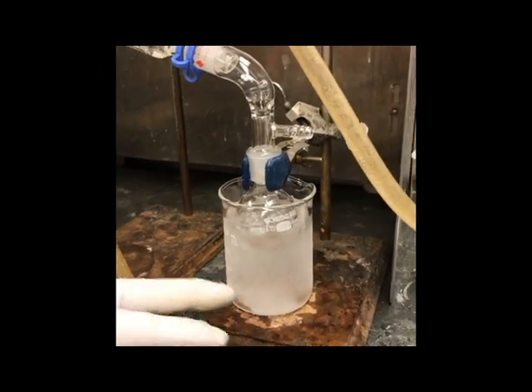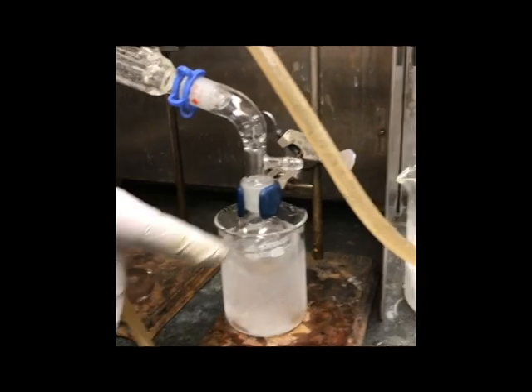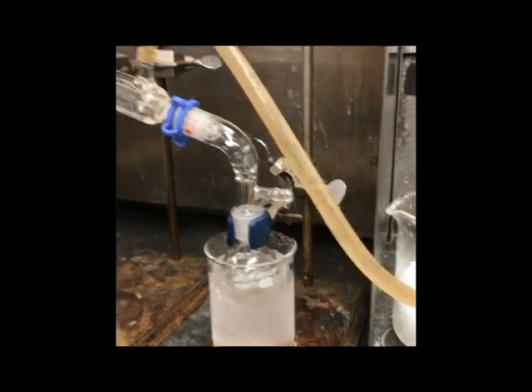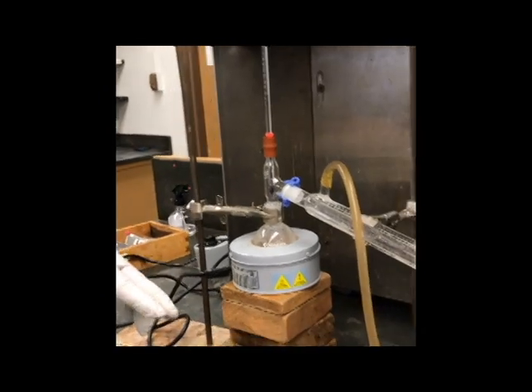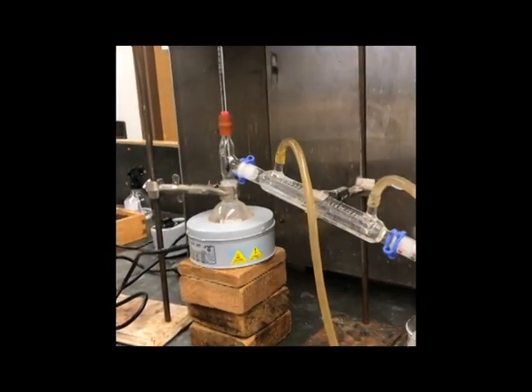Now, next thing we're going to do is we're going to be looking out for when our first drop comes into our receiving flask. And we're going to record that temperature, and we're also going to record the temperature at which we have stopped our reaction. So we will come back to you when that is completed.